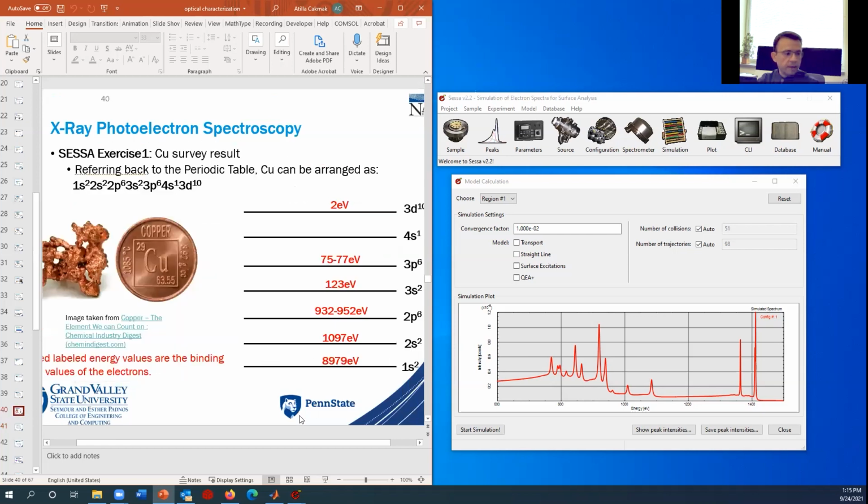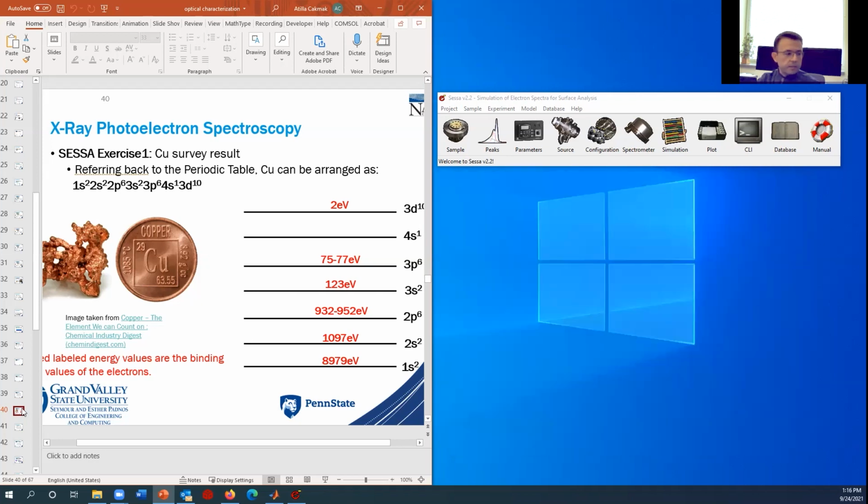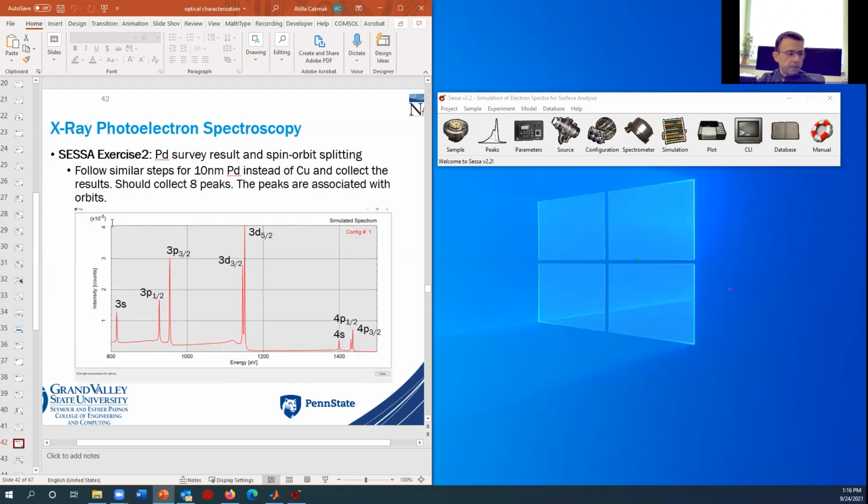So you can go back to your analysis. Oh yeah, that's really the 2s electron. If I plug in the numbers, that's satisfied in here. So the 2s electron is going to be out of the range here, because we set the spectrometer with 600 electron volts as the shortest range. If I pull it down to 300 electron volts, we would be able to see that too. Anyway, so this kind of simple analysis can be easily handled.